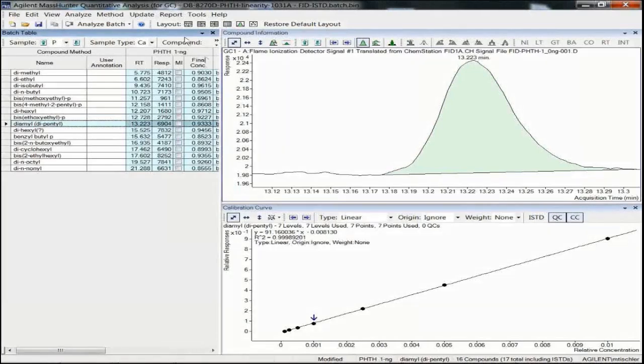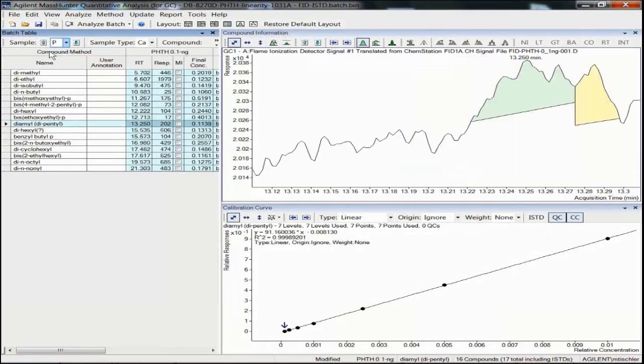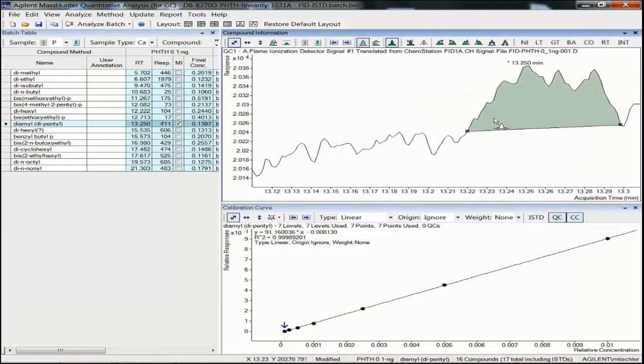All right, so here is a quick demo that shows you how that works with the toolbar. This is the GC flavor, so it shows you only the aspects from a chromatography point of view. So this will show you again the snap to baseline and then the use of recording the decision with that toolbar addition there. In this case, there's a code BA that's recorded.